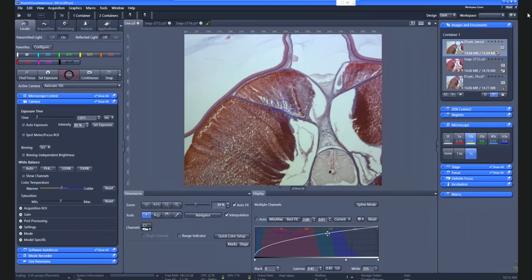So monitors are mostly set up to 6,000 or 9,000 Kelvin, and they are made to do emails or something and have a white background and black whatever types on it. And for images like this, we have to adjust this a bit. Okay, so this gamma of 0.45 is good for color images. And if you want to have the image a little bit crisper, you might check this min-max or best fit option, and then it's giving you a little bit more contrast. It's up to you what you want to do.